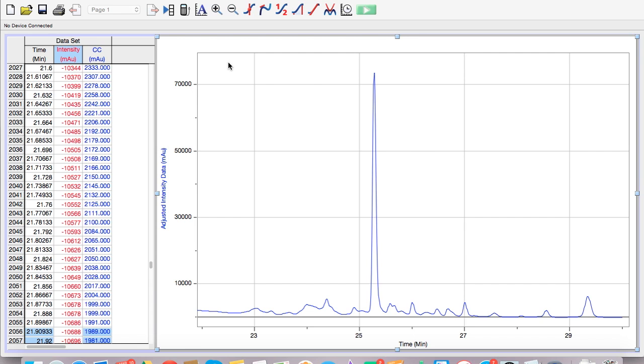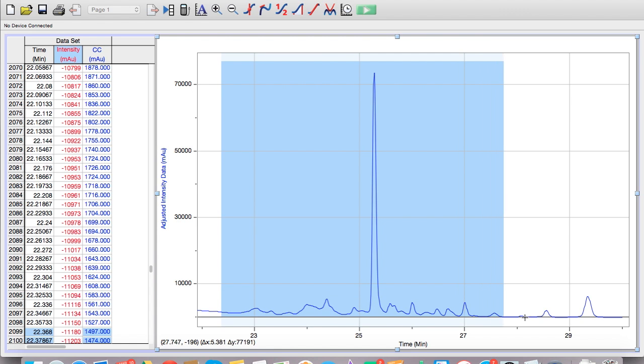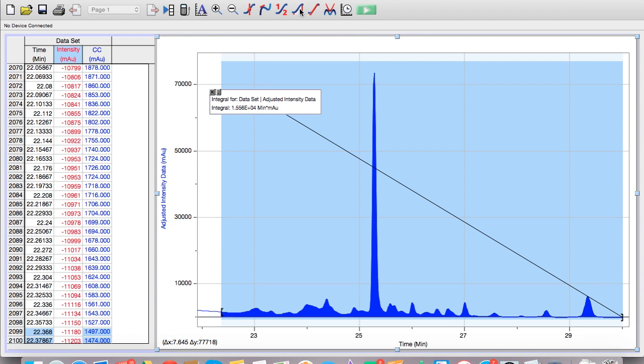If you want to integrate the entire amount, I'm going to select the entire group of peaks here, and then we're going to come up here to the top. This is the integral. You click on that, it's going to integrate. It's going to give us the area under all of the peaks, and you can see that the area is located right here. That would be 15,560. That's a good number you want to write that down somewhere because we're going to need it later.